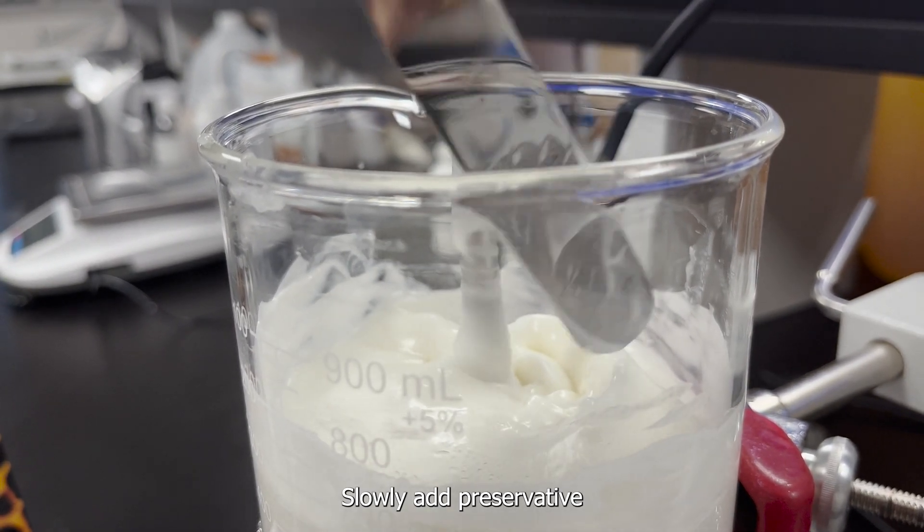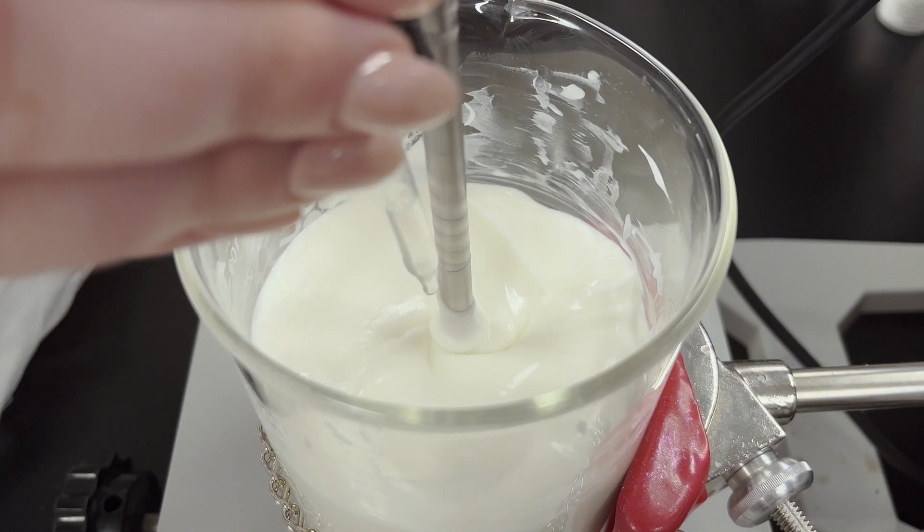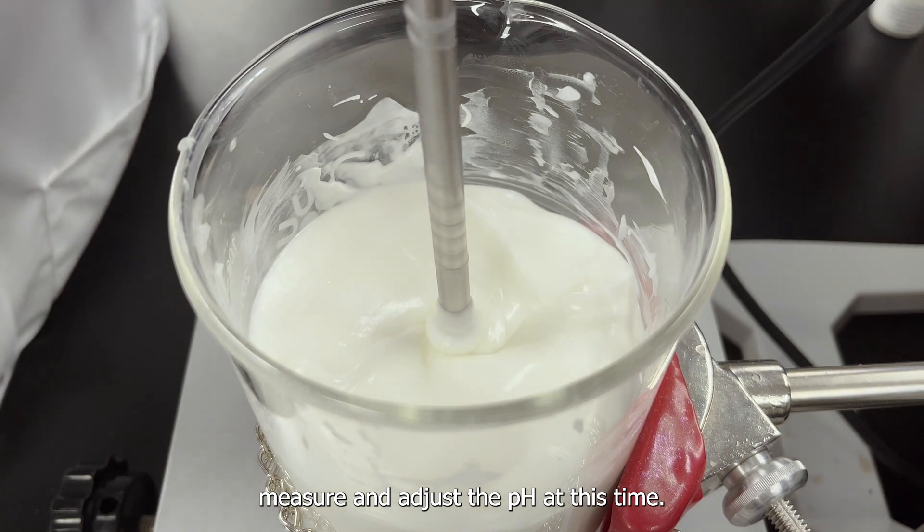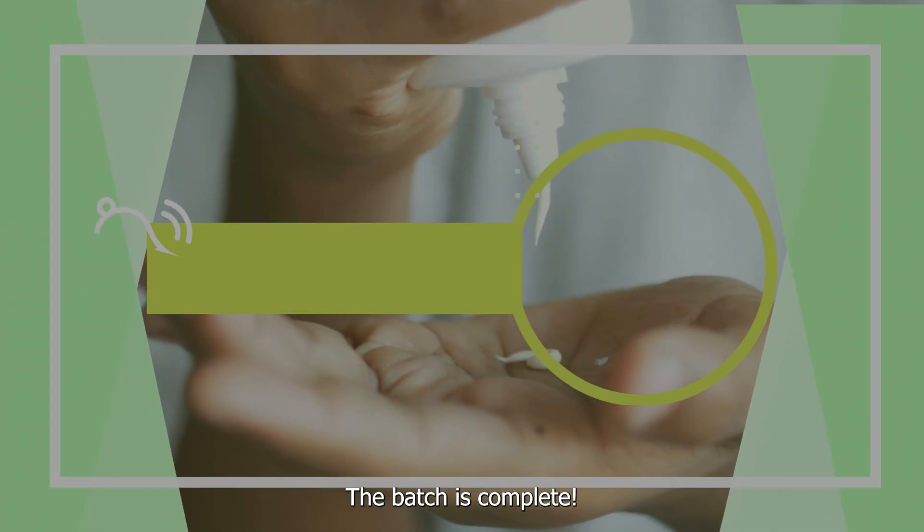Slowly add preservative to the batch. Mix until homogeneous. Measure and adjust the pH at this time. The batch is complete.